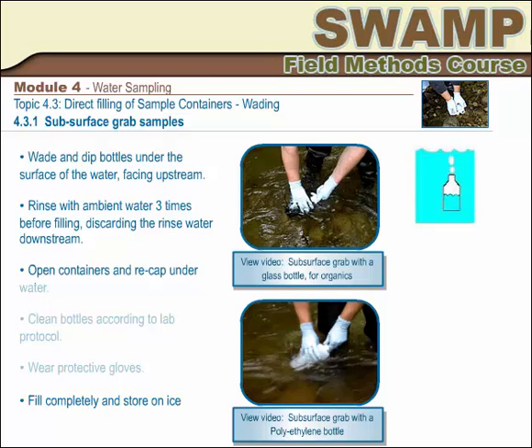Please refer to the SWAMP field protocols for current information. This method can be used with different types of containers to collect samples for toxicity testing and for analysis of conventional water quality parameters, nutrients, organic compounds, dissolved metals, and other constituents.